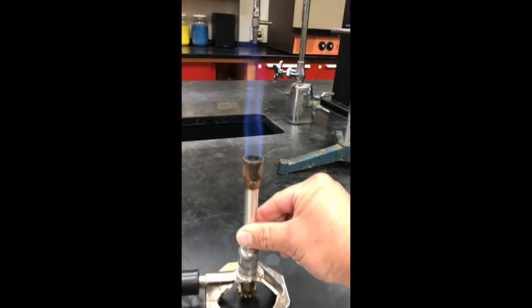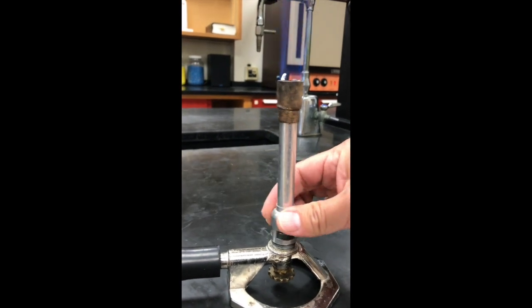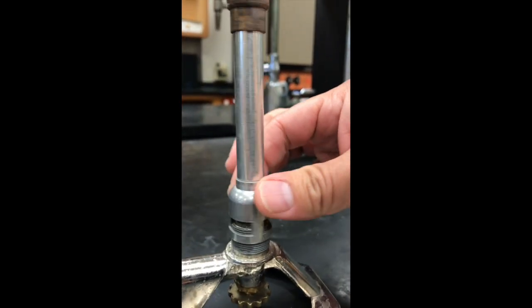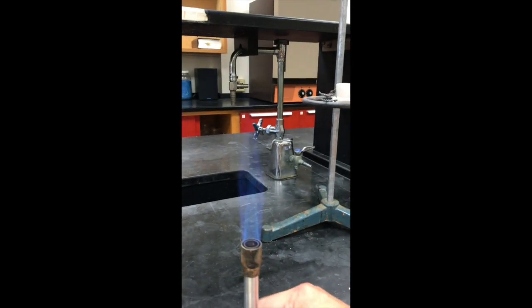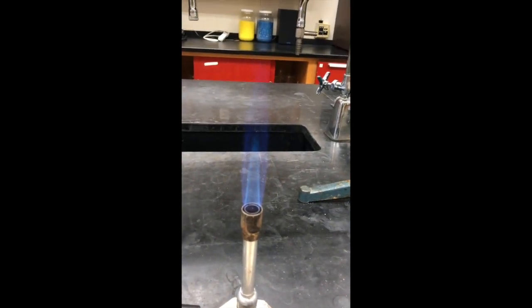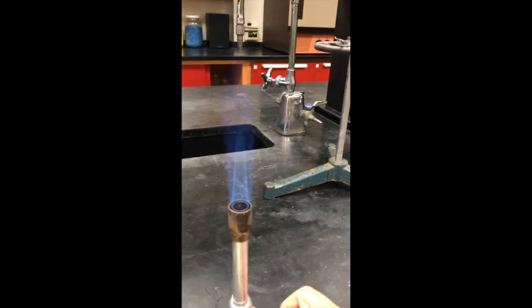The second way to adjust the burner is to turn the actual cylinder of the burner. Now this part right here will not get hot because the flame is emanating from the top. If I turn this, and right now I'm turning it counterclockwise, notice that there's a gap, a space that opens up right here. And the more I open that up, the more noise the flame makes. And see that second inner cone right here? That makes the flame hotter.